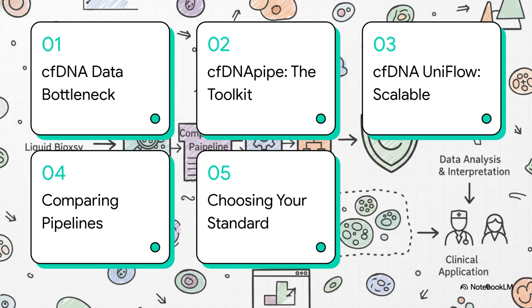Here is our head-to-head roadmap for today. We'll start by looking at the cfDNA data bottleneck, check out the cfDNApipe toolkit, explore the scalable cfDNA uniflow, run a direct comparison of their features, and finally, help you choose your community standard.